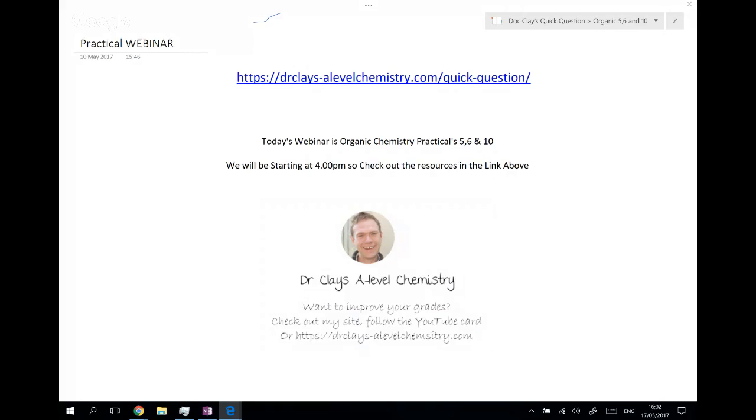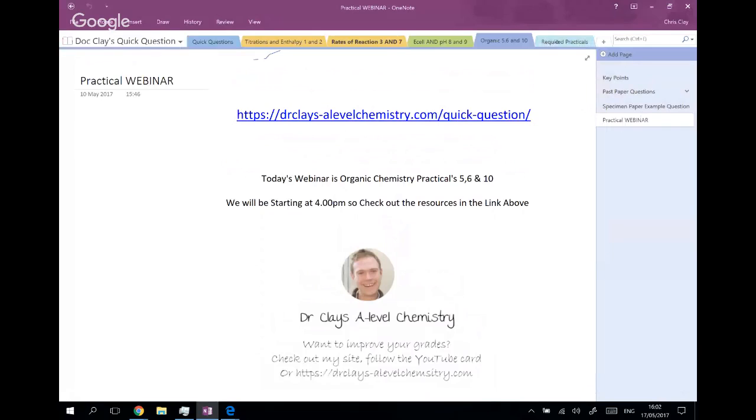So good afternoon. I'm just going to show you where we're up to with our required practicals. This is a OneNote file, and you can access that from the quick question section. Just follow the link there. You might need to type that into a web browser. We've looked so far at titration and enthalpy, which is 1 and 2, rates of reaction 3 and 7, E cell and pH, which are 8 and 9, and today we've got 5, 6 and 10.